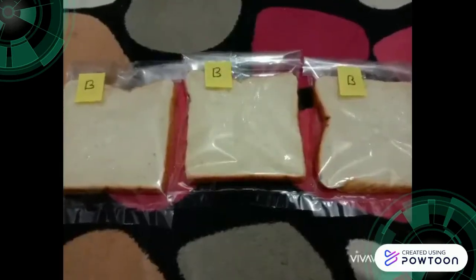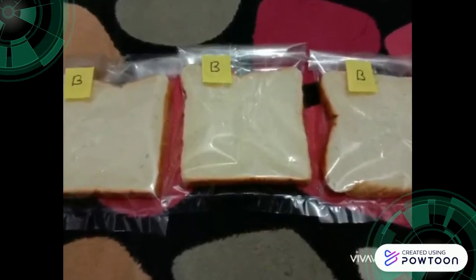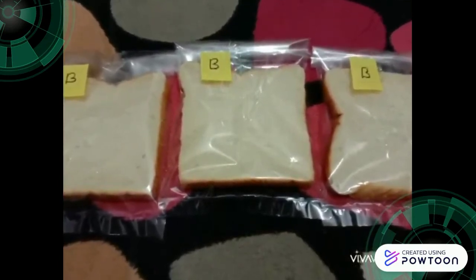This is sample that is exposed to moisture and we put in the room temperature. Then in the fridge and now in the refrigerator, and this we put under the refrigerator.